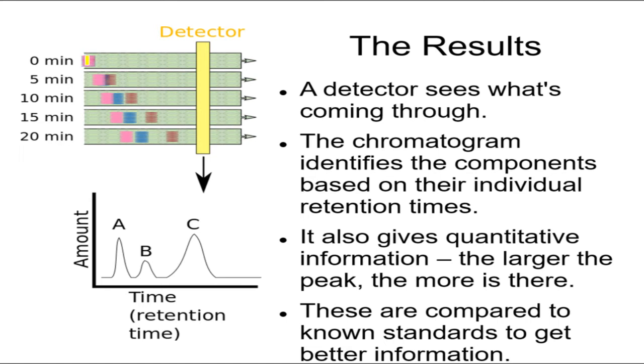And your sample has to be a gas, so you have to heat up your sample, but not enough to burn it or destroy it or react it with anything, which is always a problem. You heat something up, there may be some reactions. Anyway, so you heat it up, especially if it's volatile, if it evaporates easily, heat it up, it's a gas.